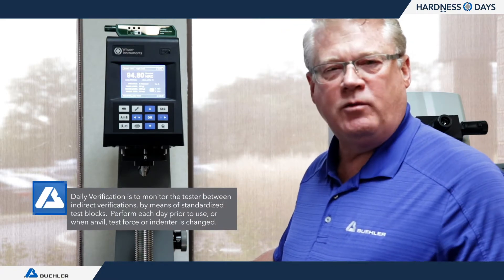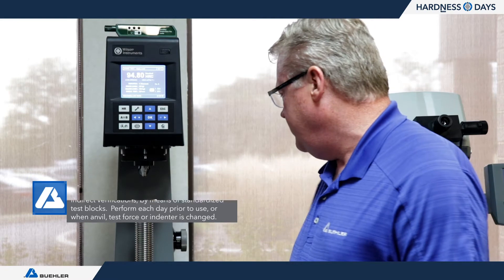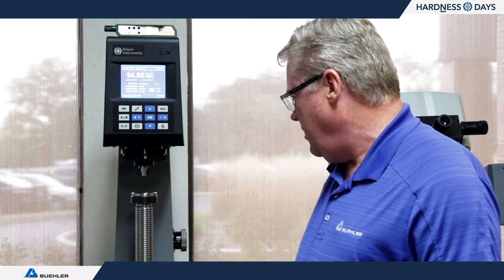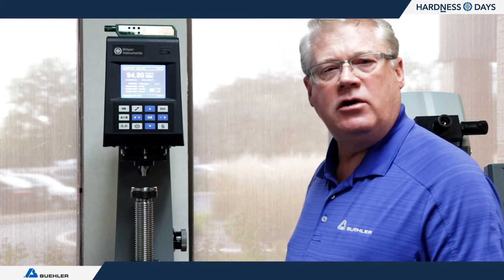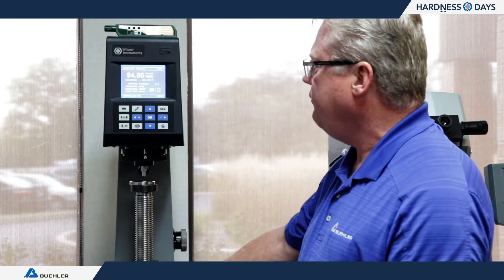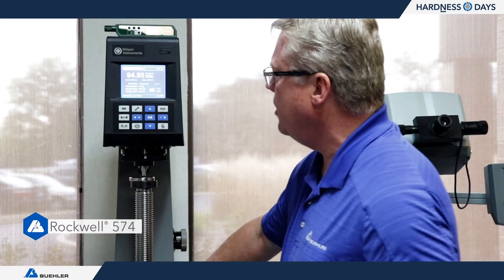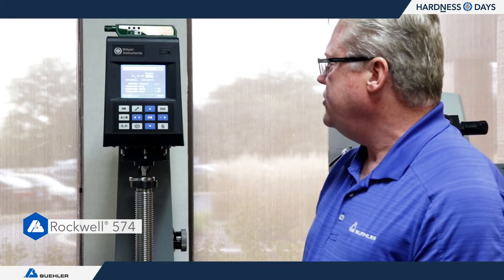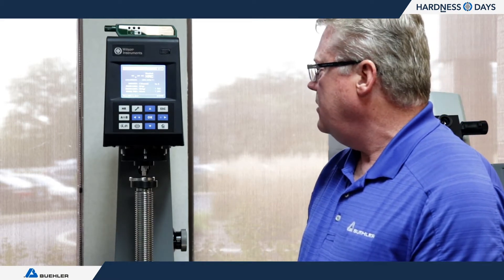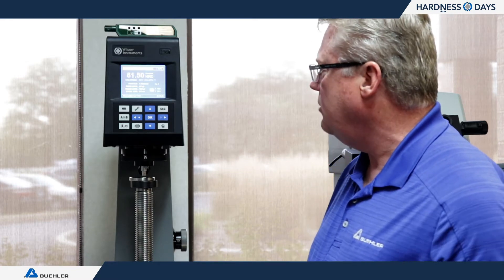The daily verification is what you're normally used to — done either prior to use of the machine or on some regular period. It's done with test blocks you have in-house that correlate to whatever scale and hardness measurement you're going to make. Here is our R574 deadweight Rockwell — the current production model — and I'm just going to show you a quick HRC test. The machine will load up, switch and change loads, and give us a hardness number. It's in the mid-60s range for HRC — 61.5.